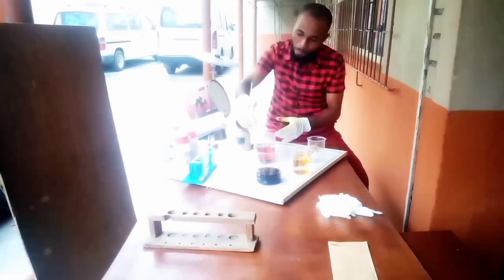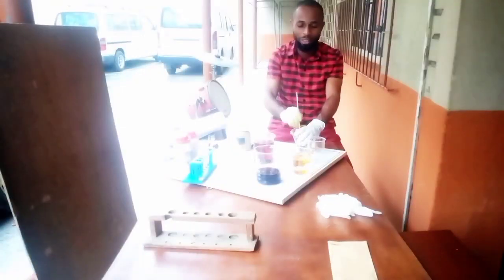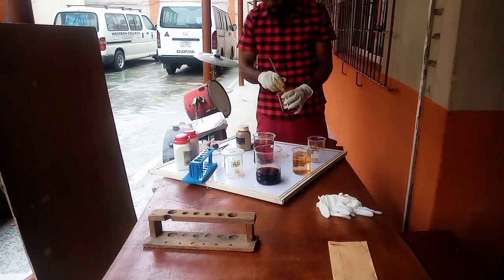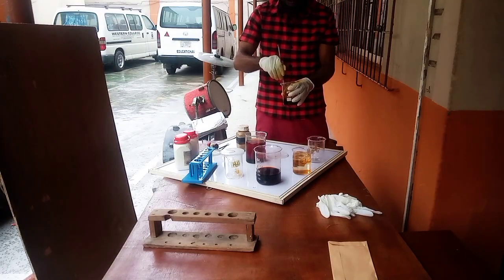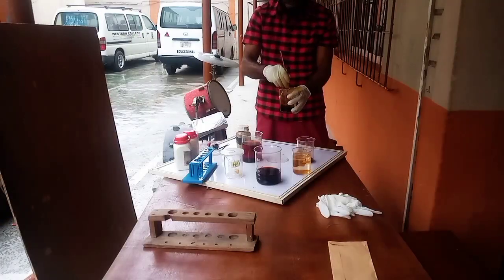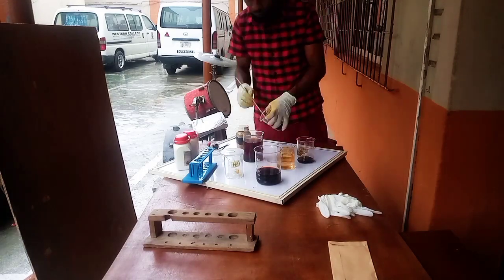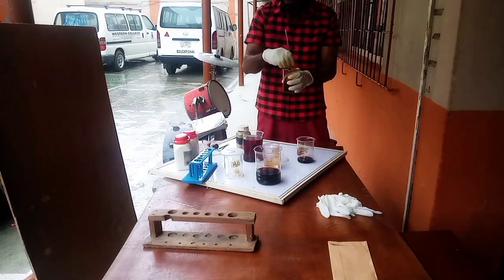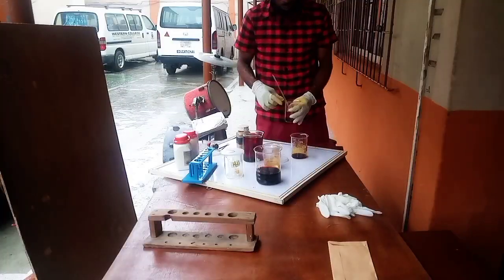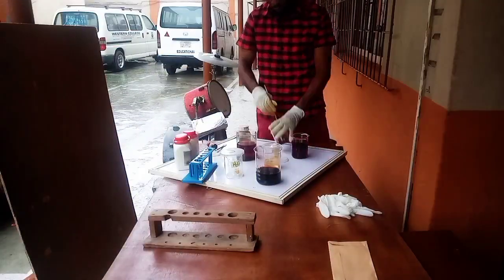I add it, I try to make sure that I grind it well, and whenever I add it, there is a different color change. This color is very different from the one you are seeing inside here. The other one is just normal water trying to dissolve iodine. Okay, I'm also going to fast forward this again because I am trying to fight for the data consumption. Okay, you can notice that the color differs here.